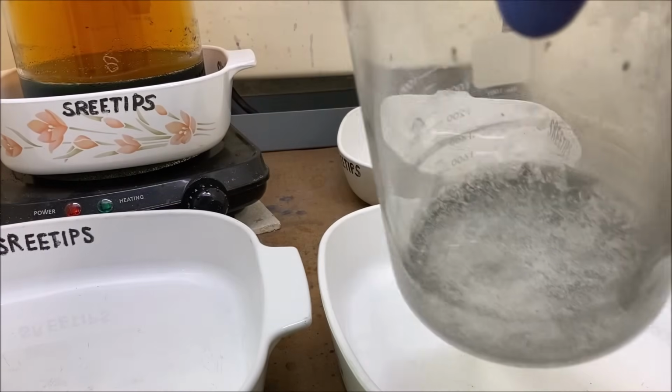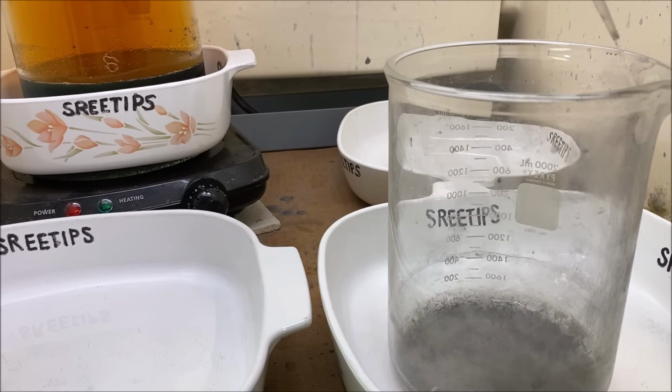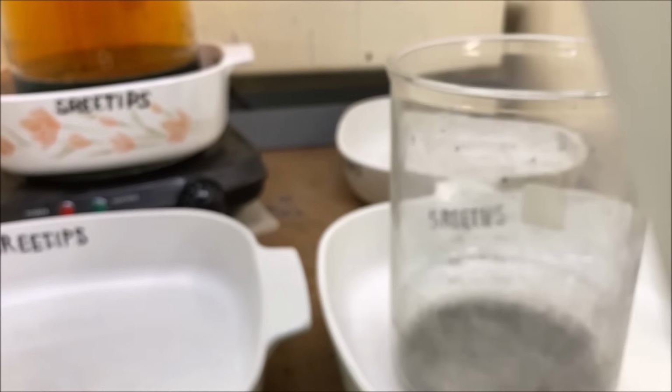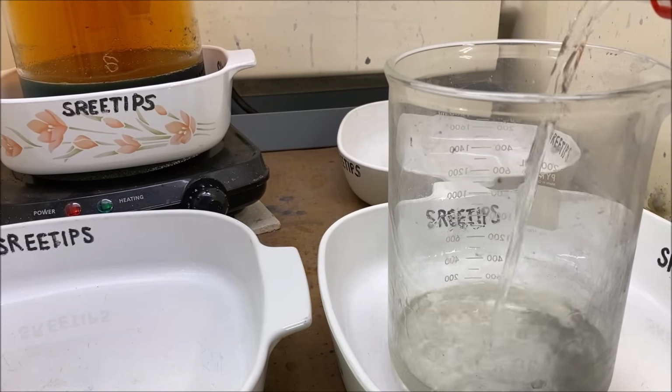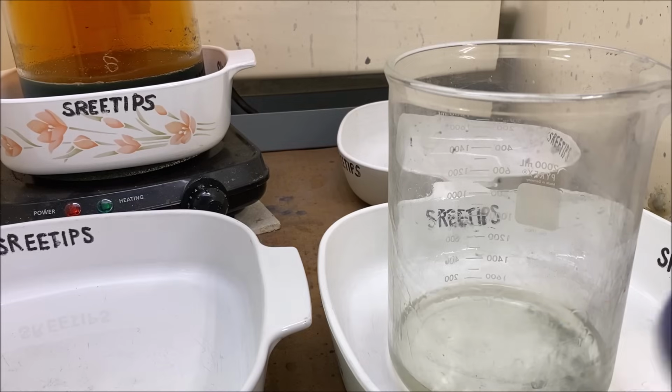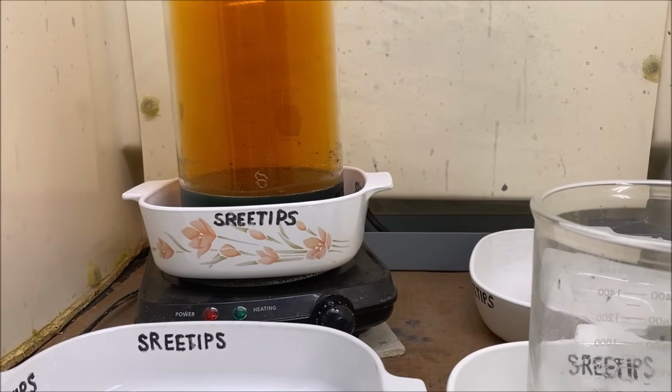There's a little residue in this beaker. So what we'll do is add some distilled water to this, and then I'll add a little bit of nitric acid to try to dissolve the residue out of here. And then, once this is clean, we'll add this to our main beaker up here on the heat.